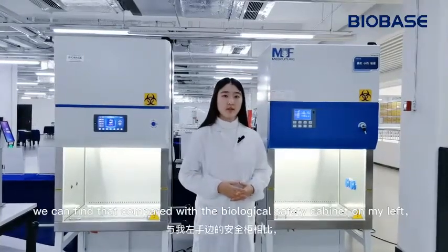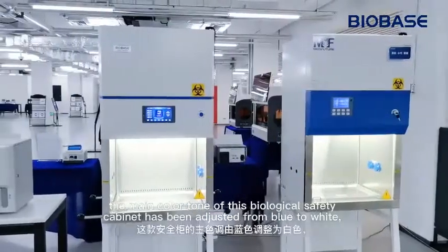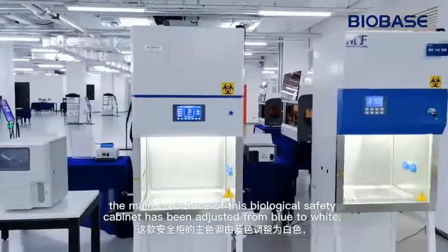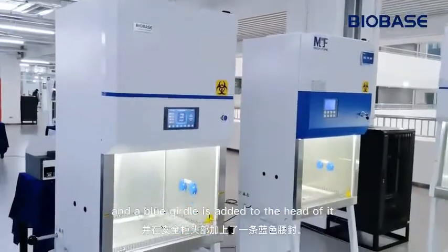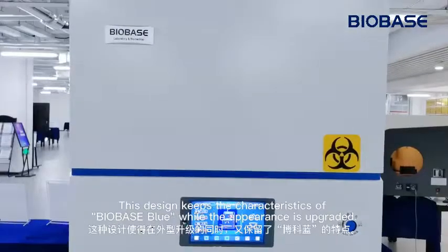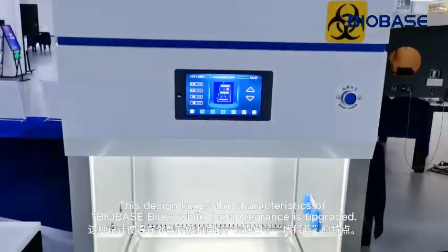But through comparison, we can find that compared with the biological safety cabinet on my left, the main color tone of this biological safety cabinet has been adjusted from blue to white, and a blue border is added to the head of it. This design keeps the characteristics of Biobase blue while the appearance is upgraded.